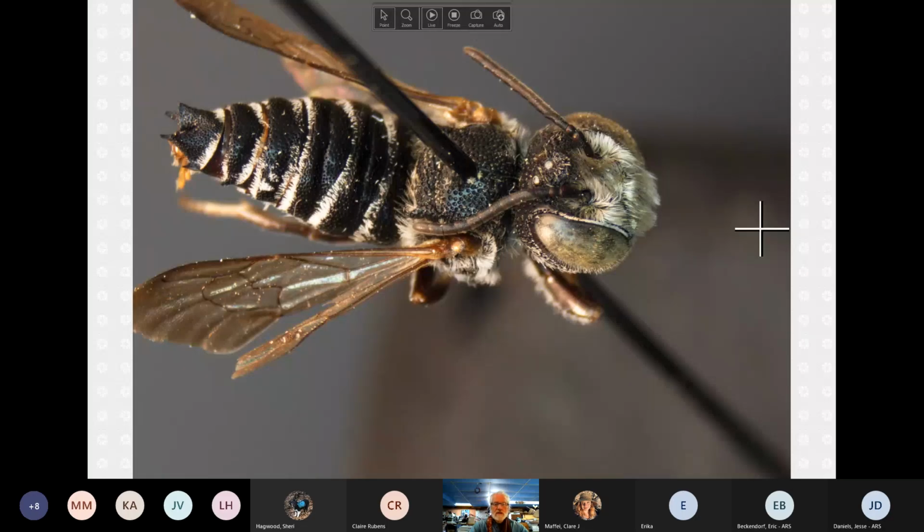Coelioxys today. Go ahead, Sam. Okay. So we went through the females. There's lots of similarity in the males to the females, but the males have several different kinds of features that will be new. And I'm going to switch now to sharing my screen and pull up the most common one, Coelioxys sayi. And we'll talk about things in general, and then we'll get very specific.